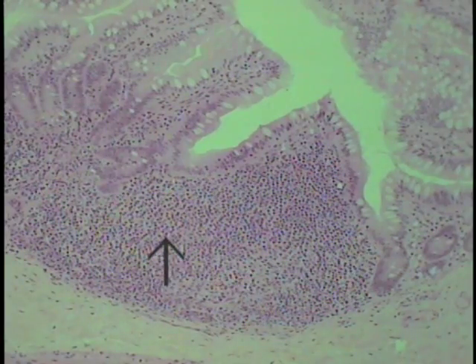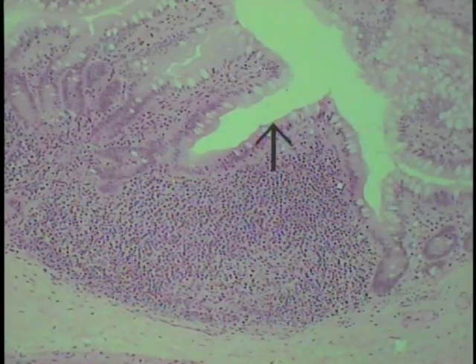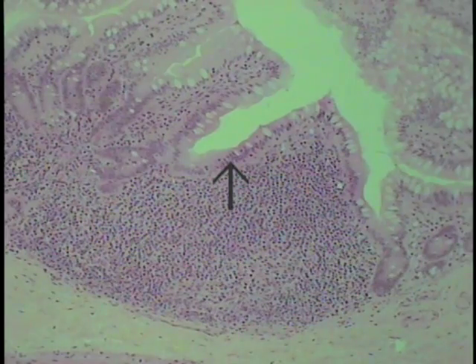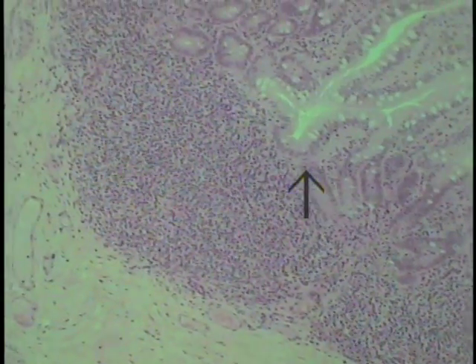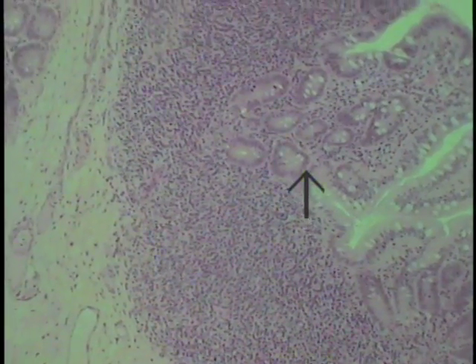Now the epithelium that overlies these lymphatic nodules and flattens out also contains another cell type, in addition to the goblet cell and enterocytes as shown here, that cannot be visualized very well on these sections, the so-called M cell. This is one of the antigen-presenting cells, or surveillance type cells, that will take molecules or antigens from the luminal surface immediately overlying it, process them, and pass that information on to subjacent lymphoid elements. So that cell type is associated with the Peyer's patches and is found in the ileum as well, though we cannot see it on this particular preparation.